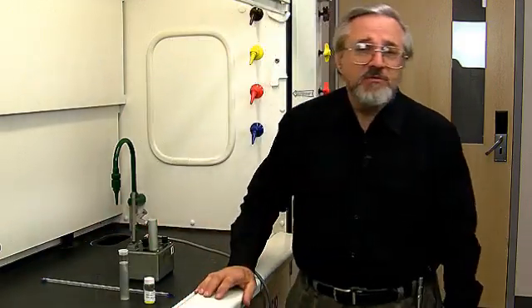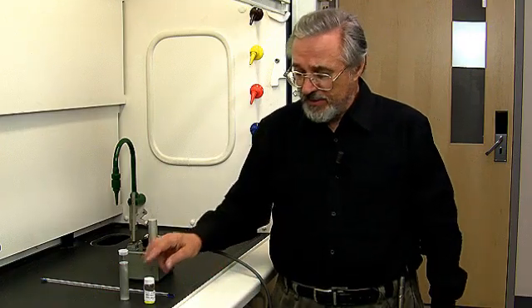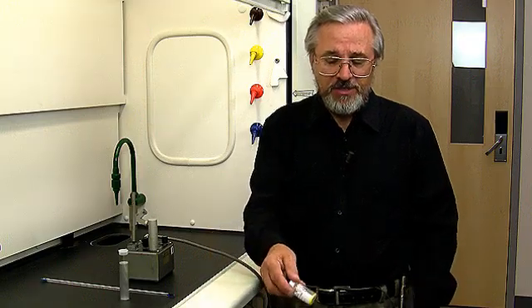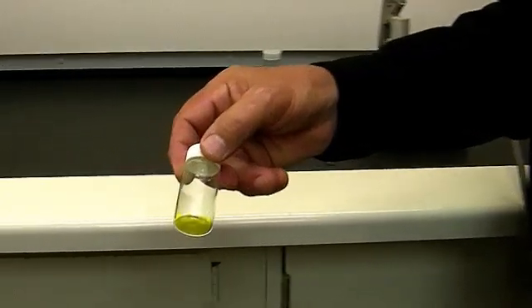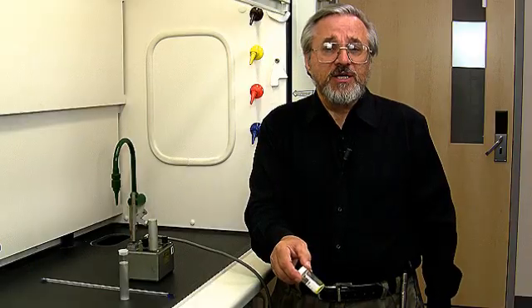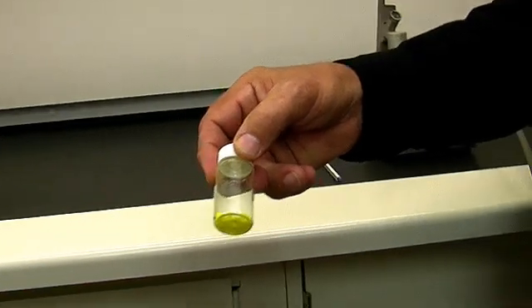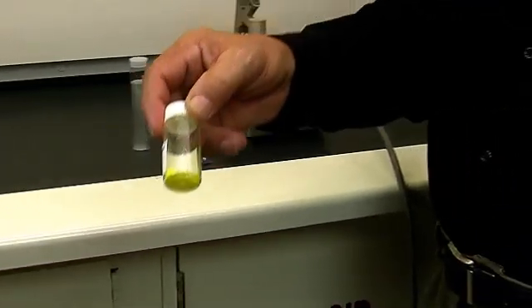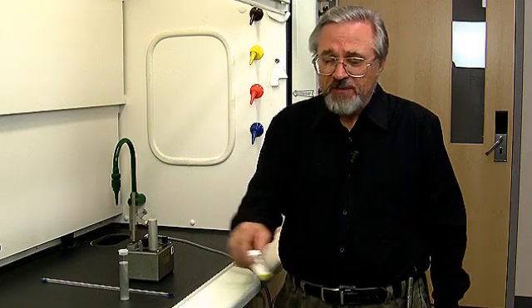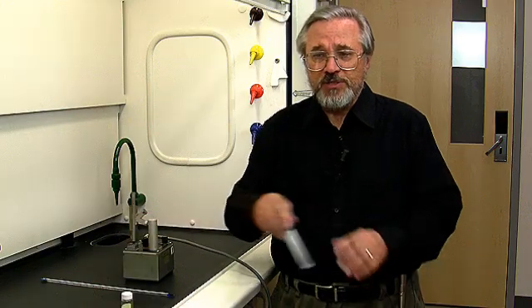The first thing we have to do is to get a sample. The sample that I'm going to take a melting point of is the compound fluorenone. Now fluorenone is a naturally yellow material, and we chose this so that we could see when the melting point phenomenon actually occurs in the sample tube which we're going to take the melting point in.